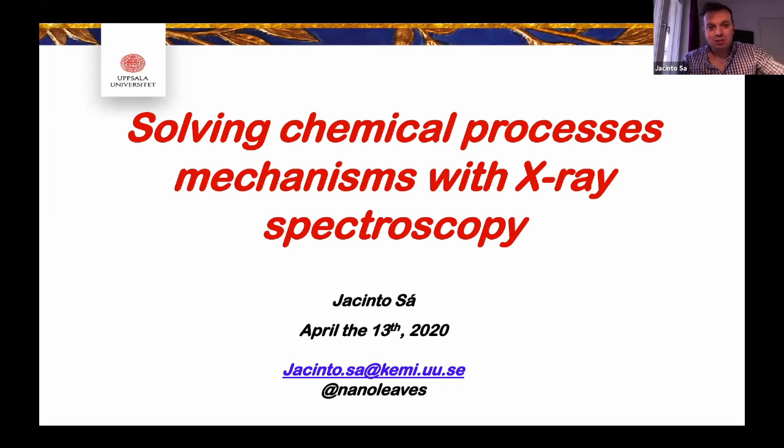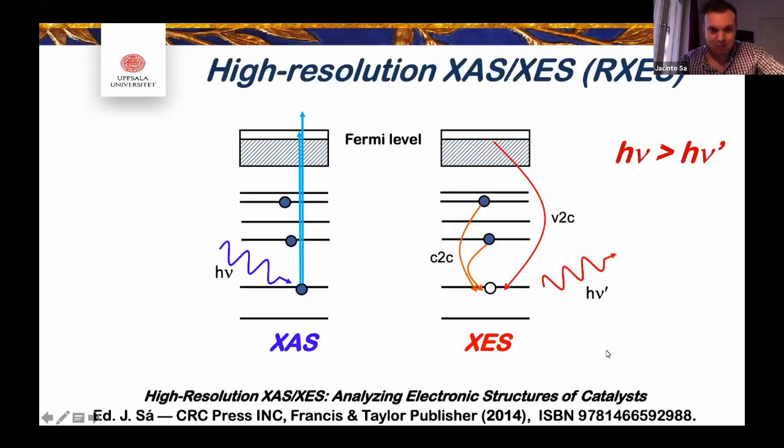It's a bit provocative in the sense that I'm not going to talk too much about methods, even if there is a bit on the method part, how we get there, but actually on using the high resolution X-ray absorption, emission, and then if you combine both, the RIXS, as a way to solve chemical problems. As I'm a chemist, I'm primarily interested in using these tools to solve problems, not necessarily on the development of techniques, even if some of you know me for some development on the techniques.